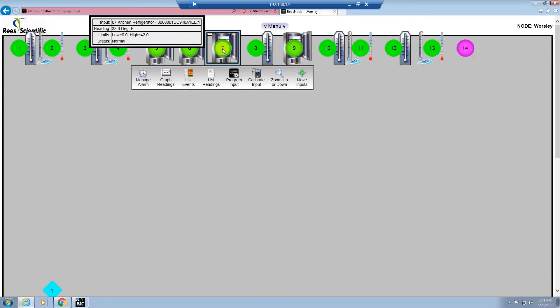You also have a menu of operations that you can use as well. The manage alarm icon will allow you to inhibit or reset an alarm. The graph readings will produce a visual graph of readings for the input. The list events will produce a report of events that have occurred for this input, and the list readings report will produce a report of the readings based on a date range that you select.